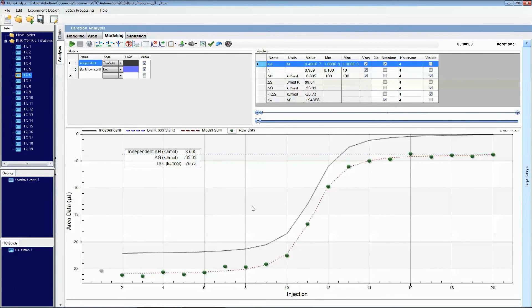NanoAnalyze gives you a way to analyze multiple files easily and quickly. The software is available free with the Affinity ITC Auto, and for the lifetime of the instrument you will get free updates. It's powerful, easy to use, and continually updated — if you need a feature, TA Instruments will provide the software you need. This is one of the tools that will help you get your automated ITC data done easily and quickly.